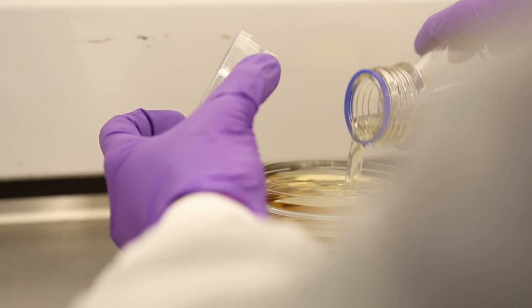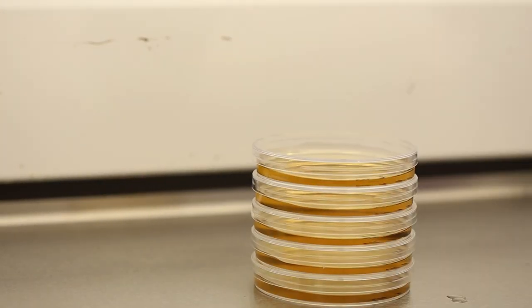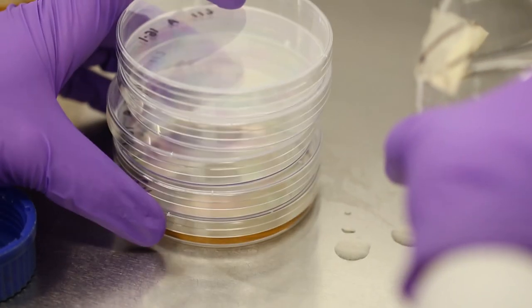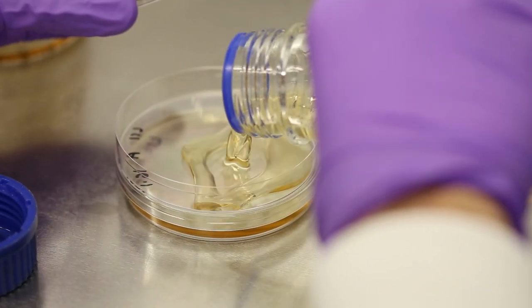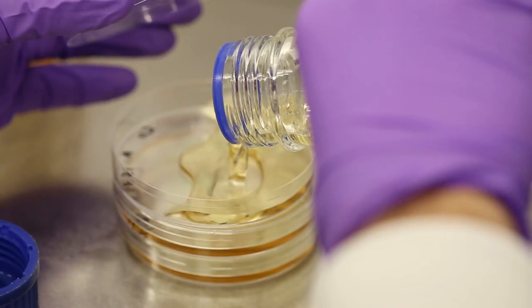It is sometimes necessary to dry agar plates before use, especially if they've been stored at 2 to 8 degrees C as condensation may have occurred. If a wet plate is inoculated, the resulting growth may be smeared and difficult to identify and count.